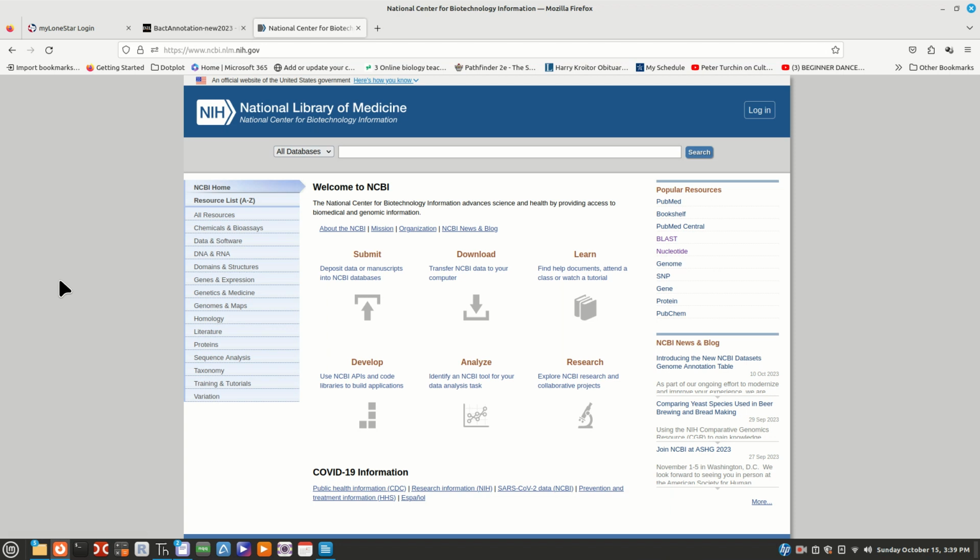Alright, since we're on a roll, I just thought I'd go ahead and make another video and introduce PubMed as part of how we use it in finding our terminators. We saw that we had a non-standard one, but there are papers out there that can help you.